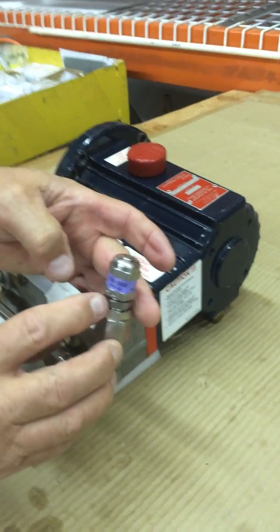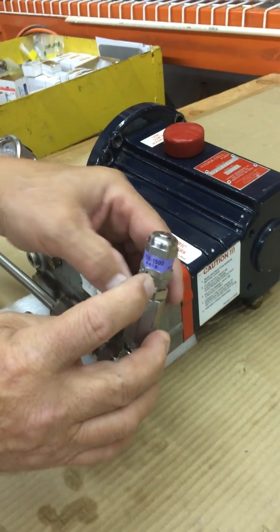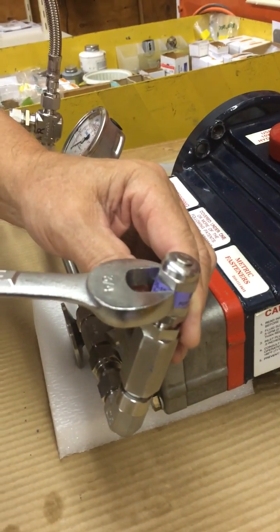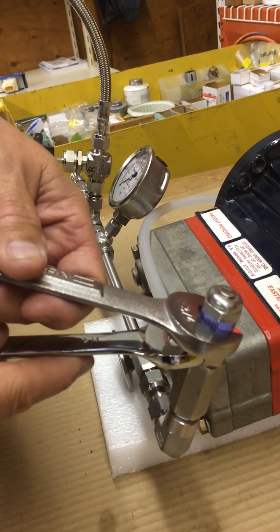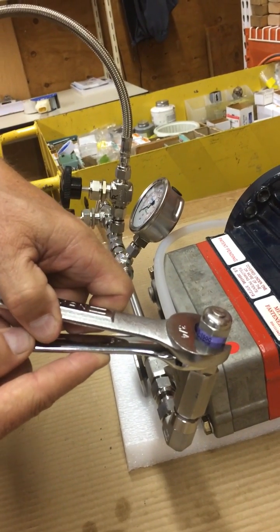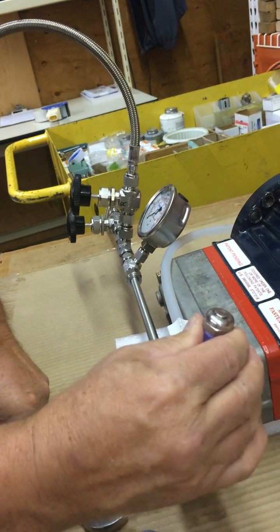On this lower lock washer, spin this up tight when you've got it up to what pressure you want it to break at. Use a 3/4 inch wrench on the top, and a 3/4 inch on the set lock nut. Tighten the bottom one counter-clockwise and hold the top one, and then it's set tight.